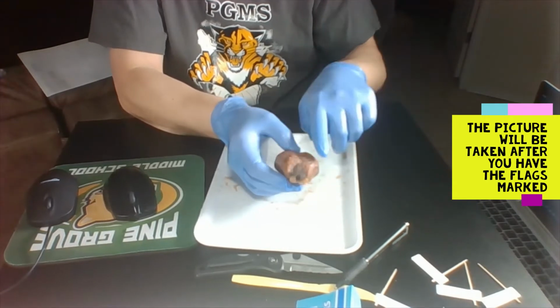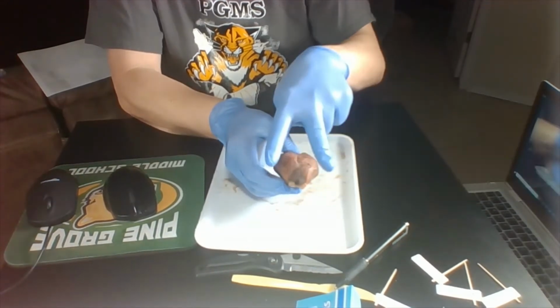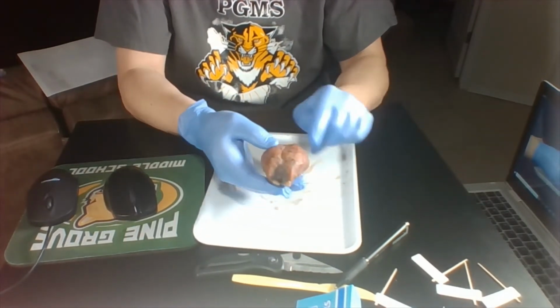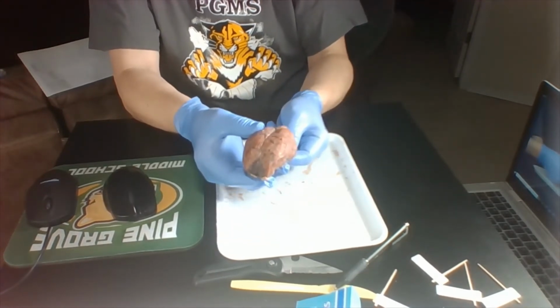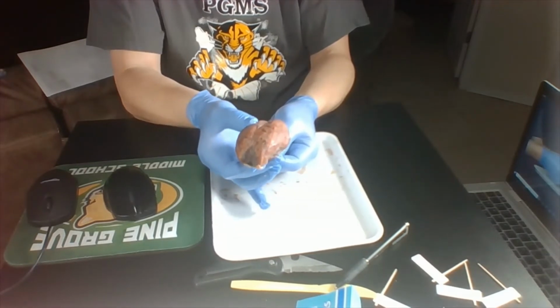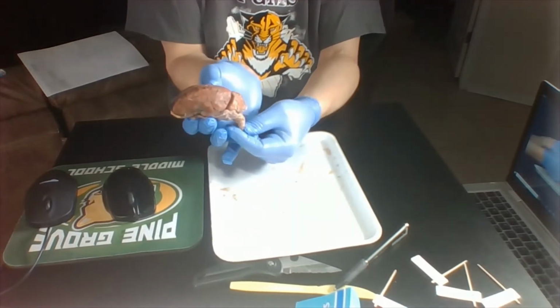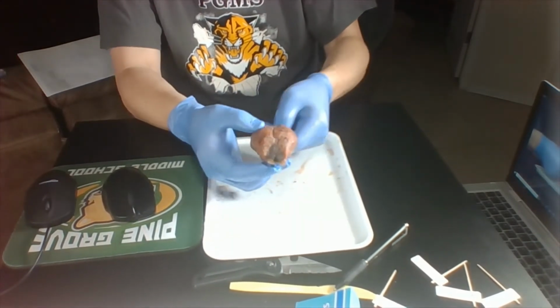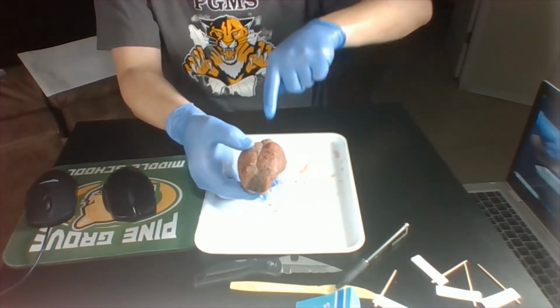So if the sheep was here, the eyes would be up here facing the front. This would be where it would go back to its back. If this was a human, the brainstem would go down to the spinal cord, but it would be more downward because we stand up straight on two legs. And as on four legs, it's going to go back because of the way it stands.